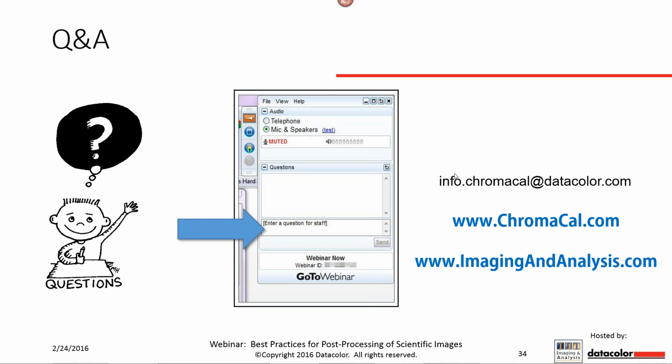Okay. Here's a customer question. This is supposed to be for Jerry. Customer says, already have Photoshop. Do I really want to buy another software program? If you're interested in saving time, I certainly know of people who have complained to me that their supervisors think that imaging takes a very short period of time, and 3 hours later they're still working on it. I think that for $349, it's certainly worth saving immense amounts of time.